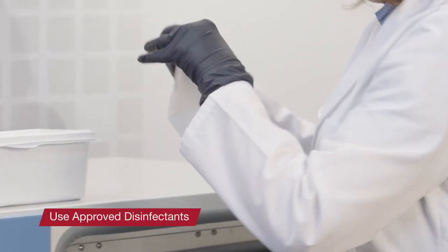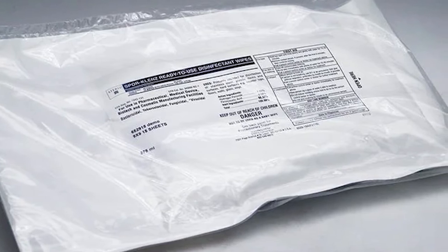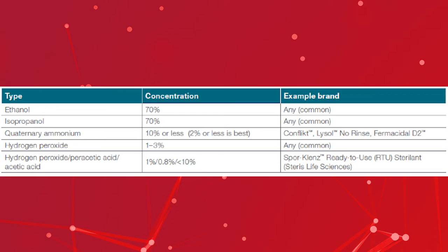Use an approved disinfectant wipe containing 10% or less quaternary ammonium, or 3% hydrogen peroxide, or a combination of 1% hydrogen peroxide, 0.8% peracetic acid, and less than 10% acetic acid. For example, Spore Cleanse ready-to-use disinfectant wipes from Steris Biosciences. For all disinfectants, follow the manufacturer's recommendations for use and dwell time, and in all cases, we recommend following with 70% ethanol or 70% isopropanol to remove the disinfectant residues. The table shown here lists recommended disinfectants.